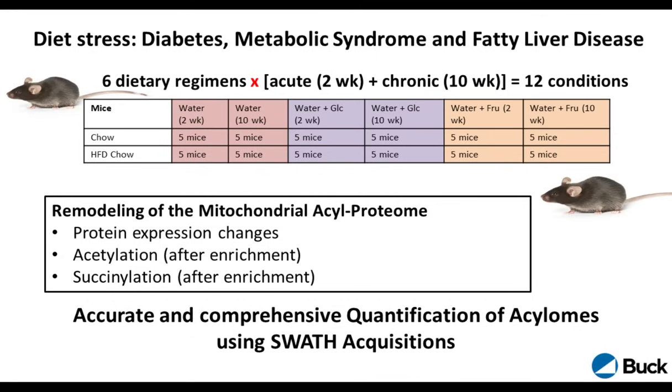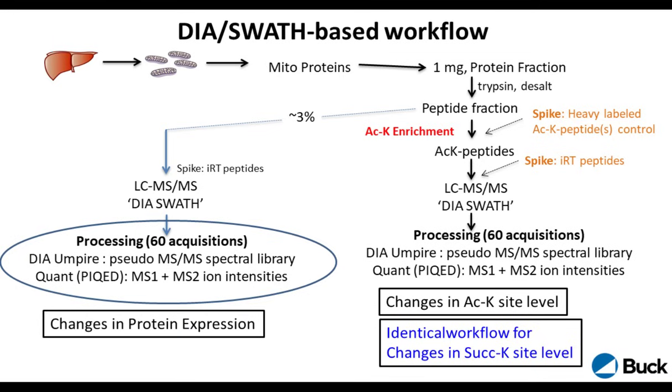Okay, we switch to the next slide. Here on the next slide, you can see our workflow a little bit. And so we would again digest the samples, get a mitochondrial extract, and then digest the mitochondria. And then, in fact, use the antibodies to enrich here. And we would start with acetyl, then do succinyl. So basically, we would use 2 separate samples for that.